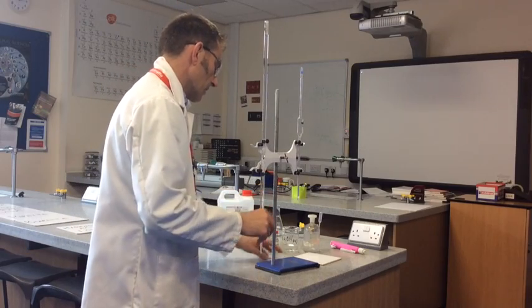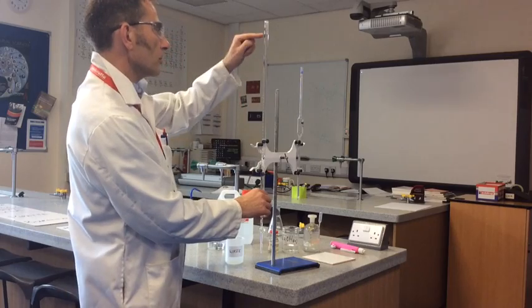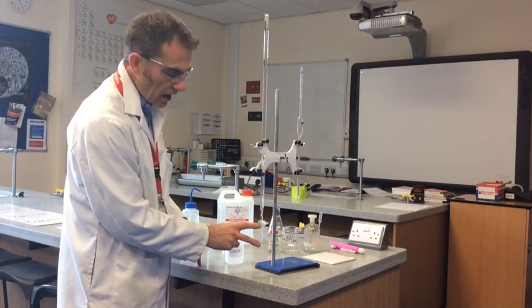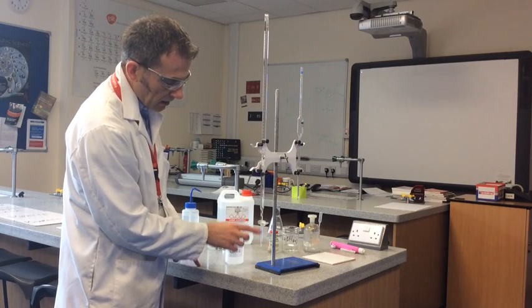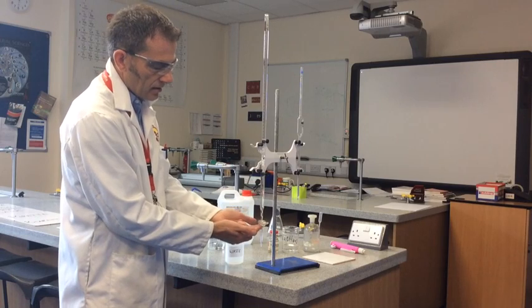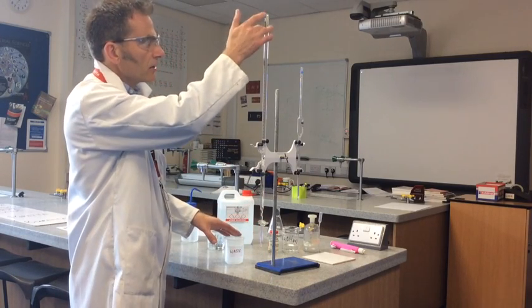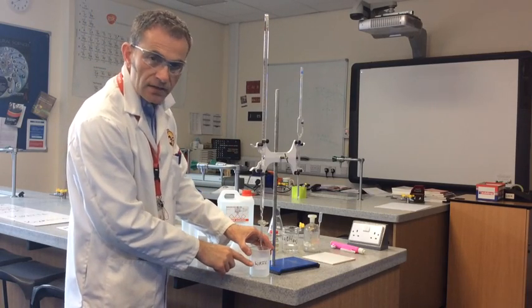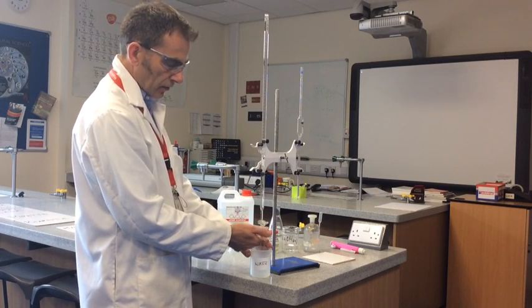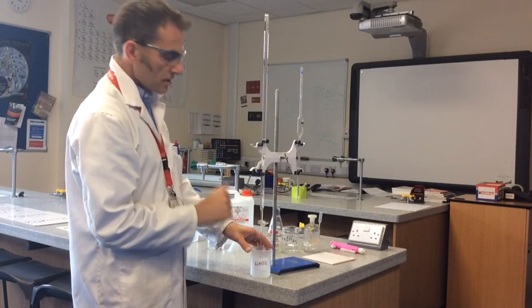I'll explain why we need to run it past zero. This part of the burette is known as the jet, and there's nothing in there yet because the tap is closed. The readings on the burette take this space into account, so it needs to be full. I've run past above the zero, so into my waste beaker I can fill the jet up. As you can see it's full now. Very slowly I'm going to run that meniscus down to the zero.